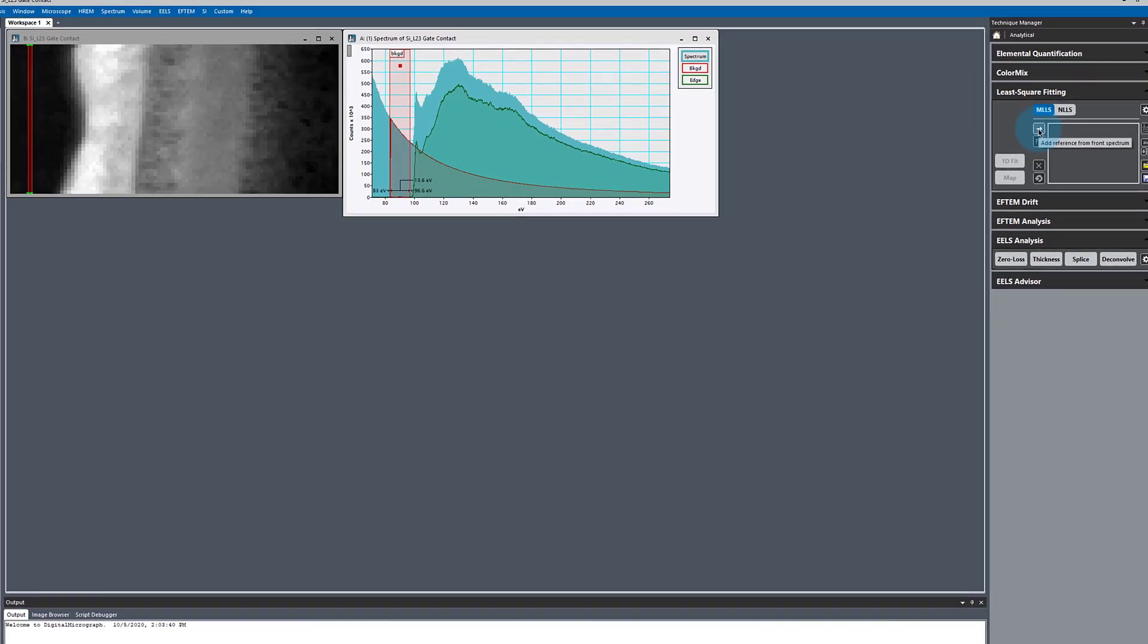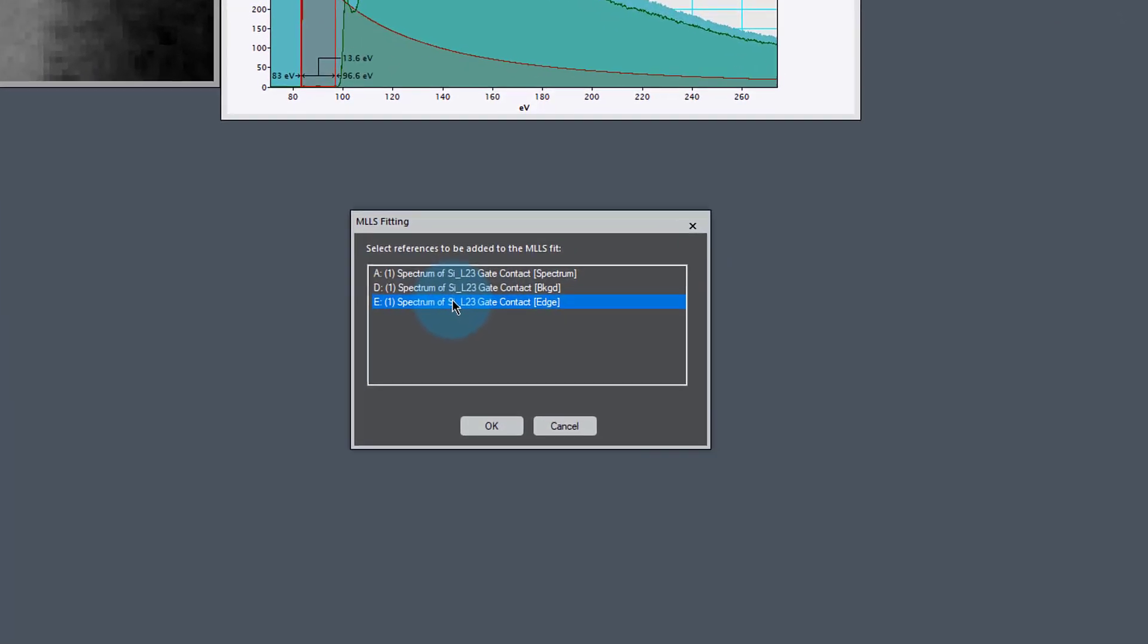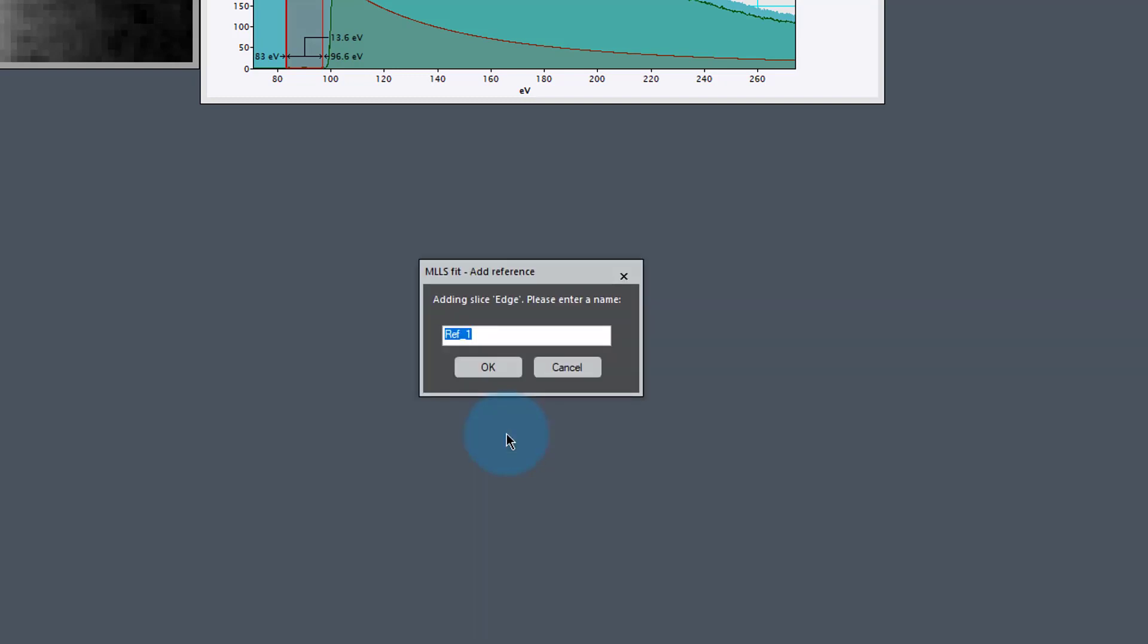I'm just going to make sure I've got a good background fit. In this region, I've got a pretty good fit to my background. I'm going to add that reference, the edge which is the background subtracted edge, and the background itself. I'm going to call this Si zero or silicon zero, because I know this is elemental silicon.